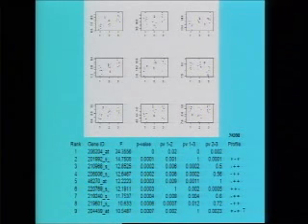The profile we write as plus minus plus. What it indicates is that this rank 2 gene is overexpressed in the non-obese group, underexpressed in the obese group, and again overexpressed in the medium obese group. So the appropriate pairwise test procedures and this graphical representation of strip charts together help us to identify the profile of the gene, how it behaves in these 3 types of groups.